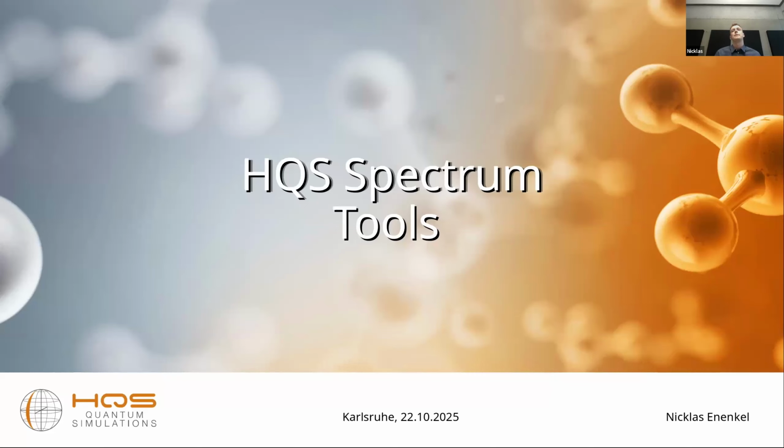Welcome also from my side. As Sebastian just said, I will talk today about HQS Spectrum Tools, which is our Python API to solve NMR spectra. And before I start, maybe a quick note on the prerequisites for this talk. I anticipate that most of you are already somewhat familiar with quantum mechanics. So I anticipate that you have a basic knowledge in the field, but no really fancy topics will be covered. So as long as you know what a Hamiltonian is, what spin operators are, density matrices, stuff like this, you should be fine.